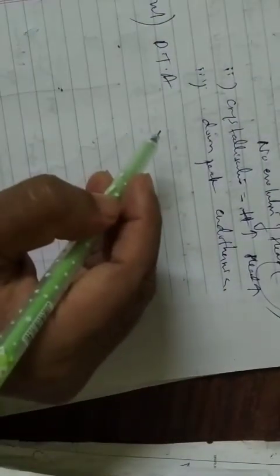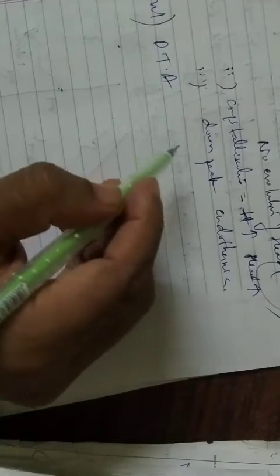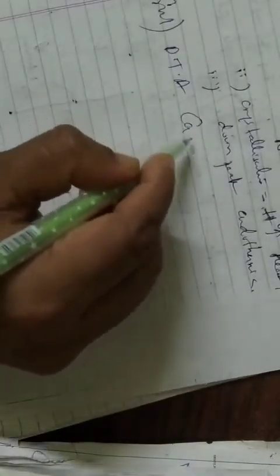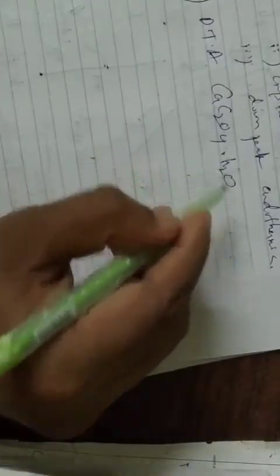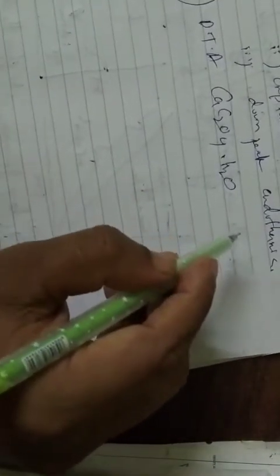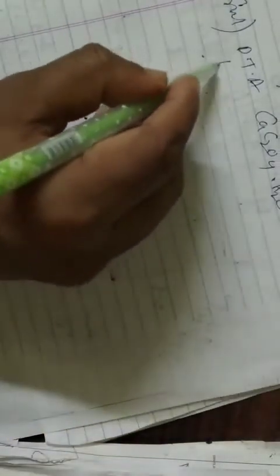Now if you take one example of DTA, differential thermal analysis, for calcium oxalate monohydrate, CaC2O4·H2O. Now we will go for this graph of DTA, so we will take it in this way, okay.